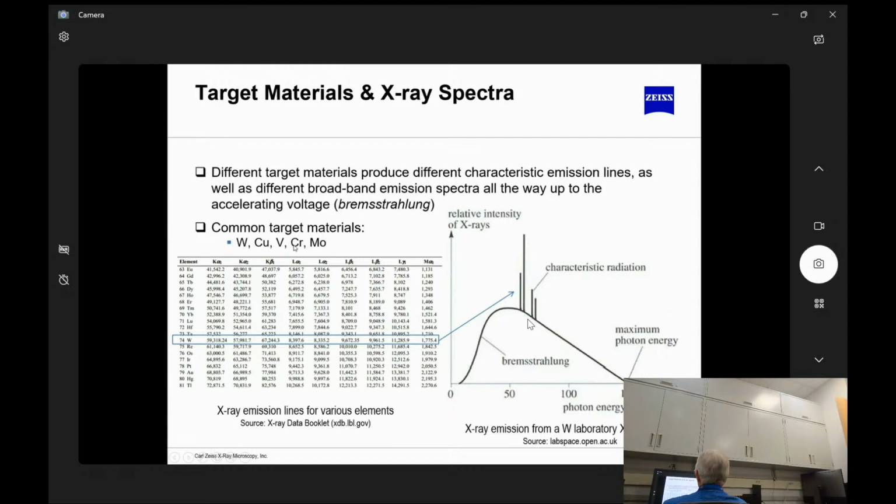We do have a moly target on a beryllium backing for the other machine. Sometimes we can get better contrast there with insects, for example, or small polymers, if I want to go down to 30, 40 kV. In general, though, the lifetime on tungsten targets is going to be a lot longer.